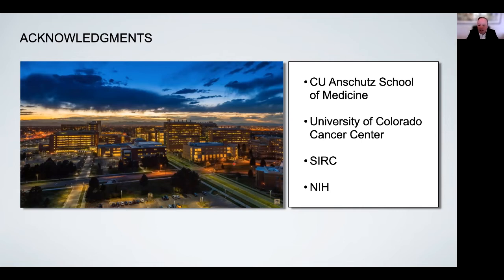You can get a vast amount, many tens of thousands of images of particles preserved in a stain, in a matter of an hour. And then overnight, or probably quicker than that, in a few hours, you can generate 2D class averages. So in order to do imaging in stain, you need a vanishing amount of material, and you can get results essentially in a few hours.